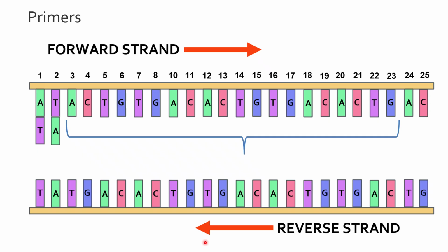Because even though you only have those 4 letters, they appear in unique patterns in certain areas. So if you can create a complementary pattern half that will go onto that, and then you add a fluorescent dye to it, then when you're running it through the machine, it's able to pick up that fluorescent dye. You've built this primer so that you know exactly that it's going to go on position 1 and 2. And so then it's able to say, hey, start reading me right here, and then go this way and find all the values that you can.